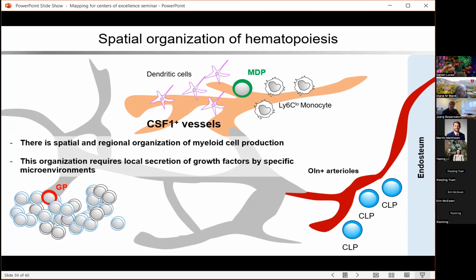One question, looking a little bit ahead. You showed very impressively how you overcame the multicolor imaging challenges here. And I think you had in the end seven different colors, seven stains, plus then the confetti mouse stuff. Is there any need for more colors, or are you content with that? And if you need more colors, have you considered using CODEX or these kind of methods for multicolor imaging?